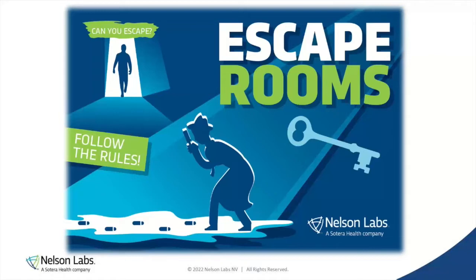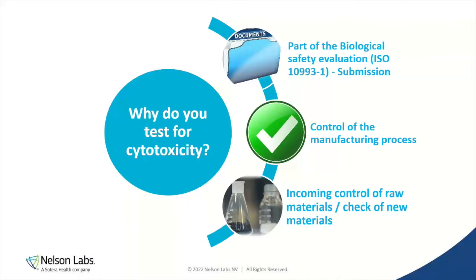First of all, before we start playing the game, we have to understand why we perform the test for cytotoxicity. Why do we test medical devices? It's part of the biological safety evaluation. It's described in ISO 10993-5, but also in the general safety evaluation, ISO standard part 1. It is an endpoint which you need to evaluate. I might be mistaken, but you can correct me, 99% of all devices on the market have been tested for cytotoxicity. Yes, or they should have been.